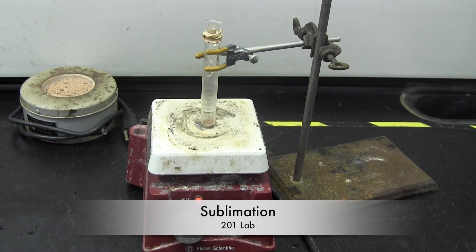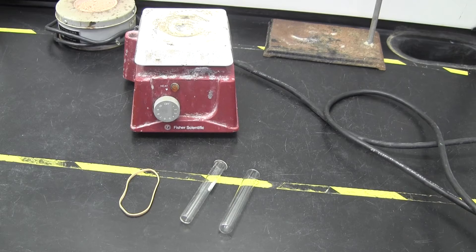In this lab, you will be separating your unknown from the impurity by a method called sublimation, which is a combination of evaporating and condensing matter.